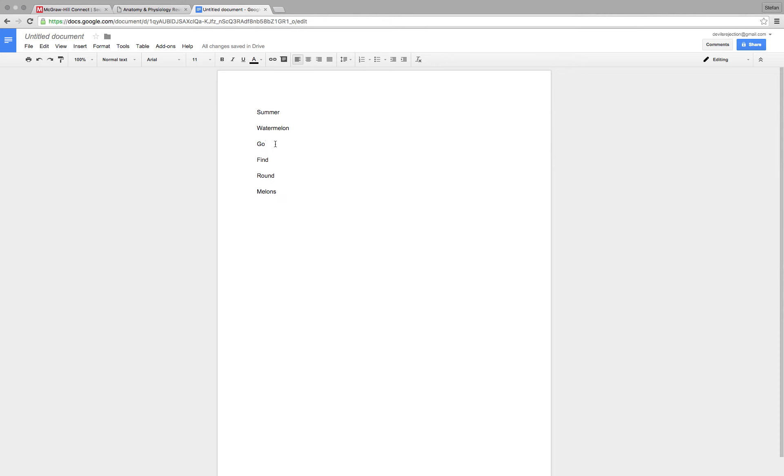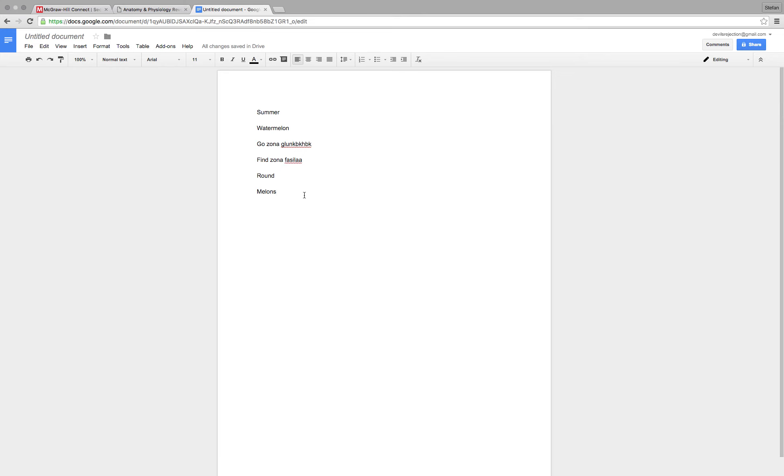That's your little mnemonic there. The G is your zona glomerulosa, I don't even know how to spell that. The F is the zona fasciculata, I have no idea how to spell, I'll let you handle that. The R is the zona reticularis. And the M is the medulla.